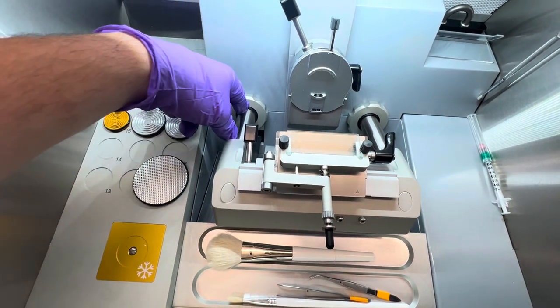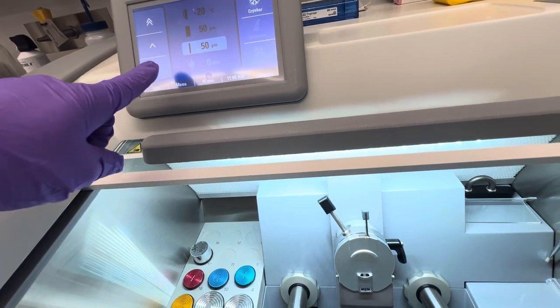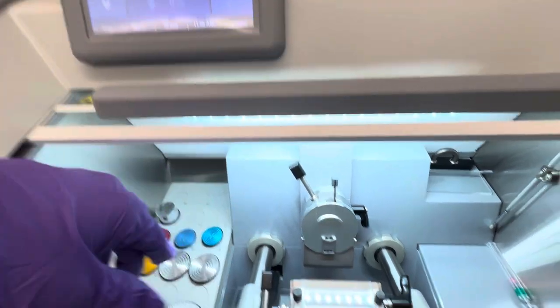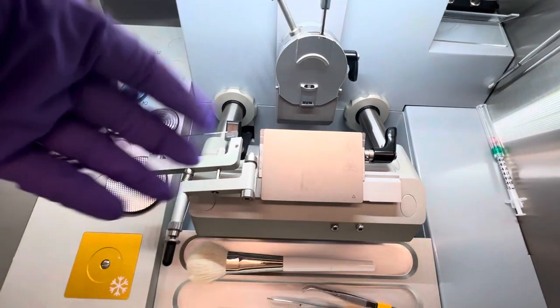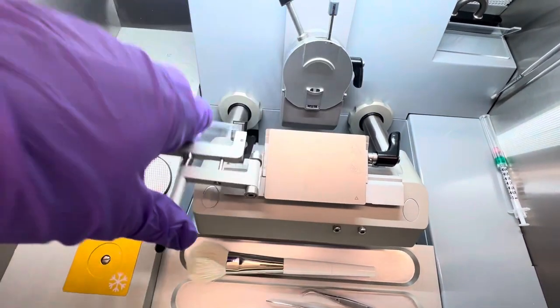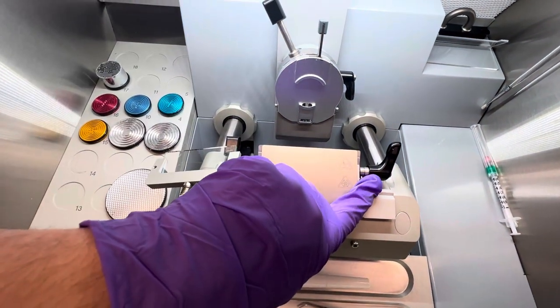This is the knife stage, and as you just heard, this can move in or out, and that is adjusted by this. This is to move quickly in, slowly in, quickly out. You would start quickly in, and then as you get closer to the block, you'd move a little bit slower, and so on. Doesn't need much more explanation than that. There's a bunch of pieces we can go over. This adjusts so you can move it left to right, but you won't need to do that. Just keep it centered. This is to unclamp and put a blade into the slot, so this is the clamping for the blade.